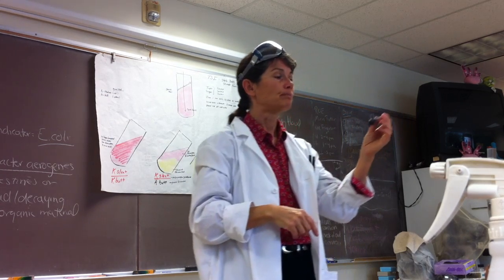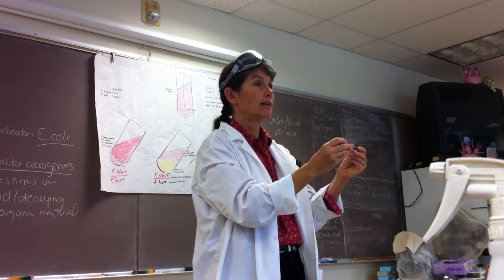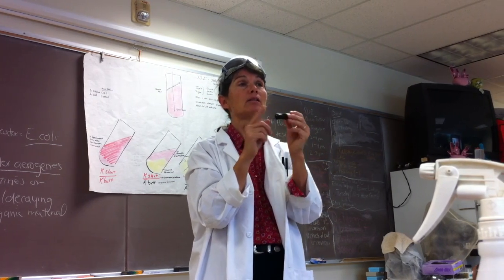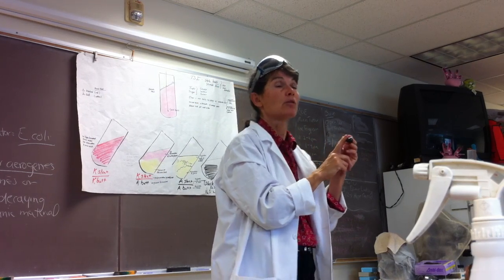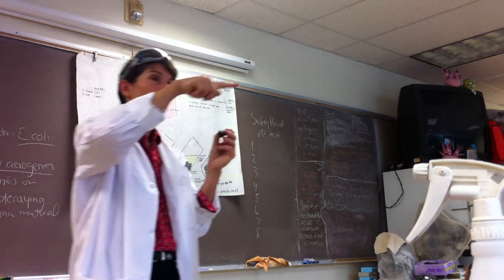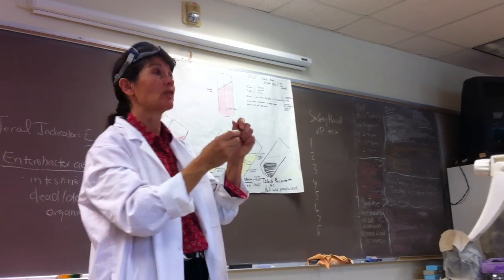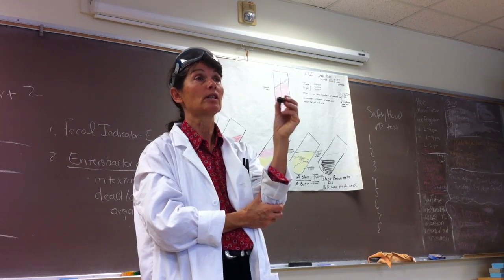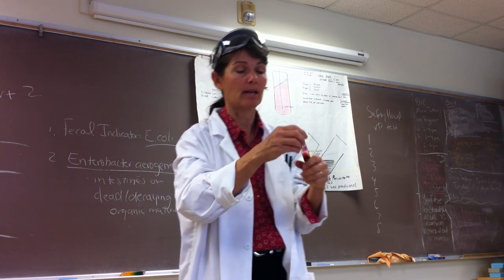Let me sweep this line. Good. A second way they can make hydrogen sulfide is how? Aerobically. Yeah, some of them can use sulfhydryl-containing amino acids as an alternate source of carbon and energy. So when they strip off that sulfhydryl group, it gets released as what? Hydrogen sulfide, right? So that's the second way they can make hydrogen sulfide, through the breakdown of sulfur-containing amino acids, like cysteine is a great example. Good job, you guys. Excellent.